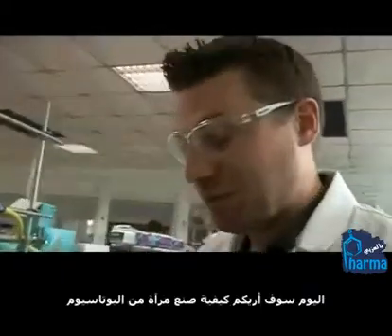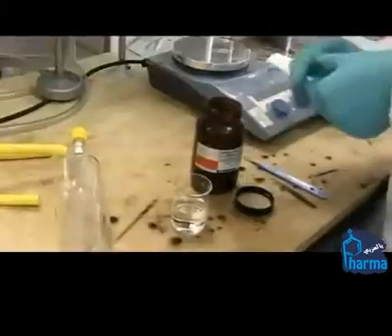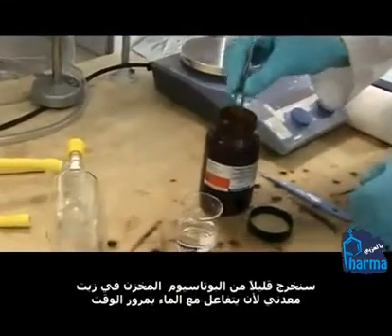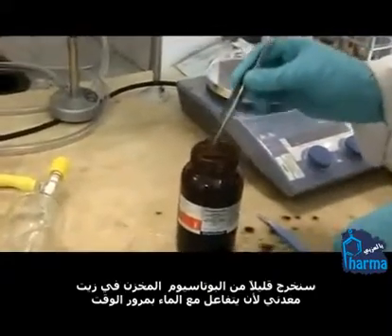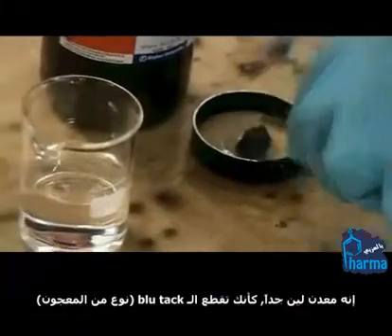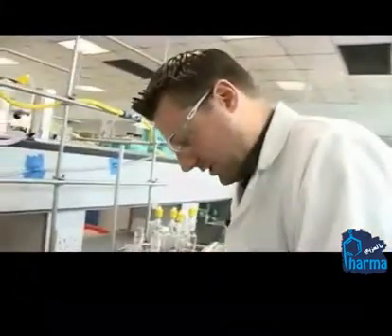Today I'm going to show you how to make a potassium mirror. We'll just fish out a nice little bit of potassium. It's stored under mineral oil because it reacts with water over time. It's quite malleable — a little bit like if you imagine cutting blue tack. It's quite soft.